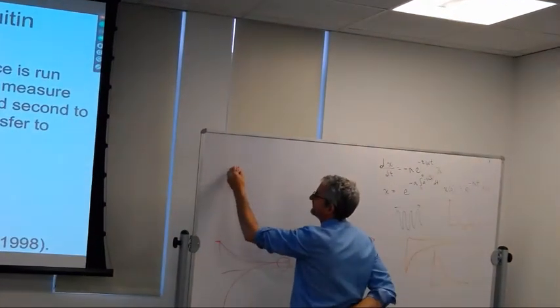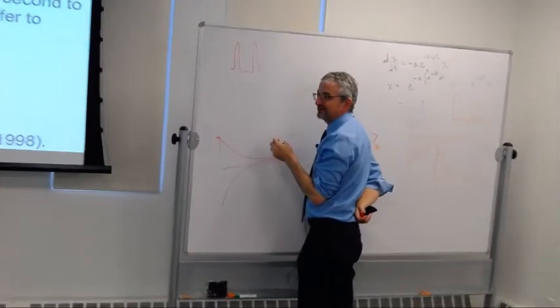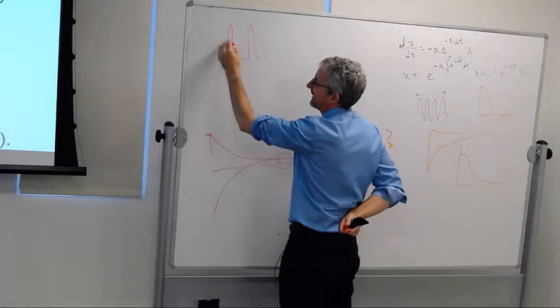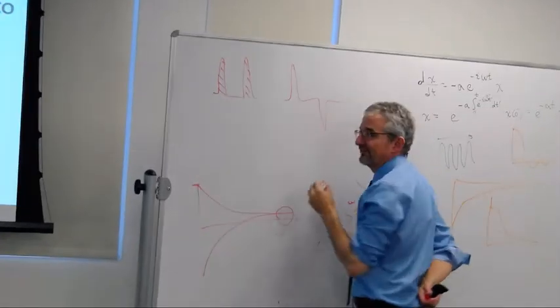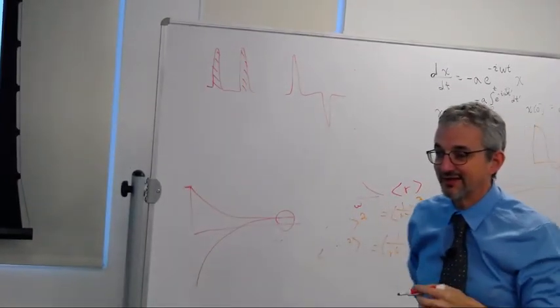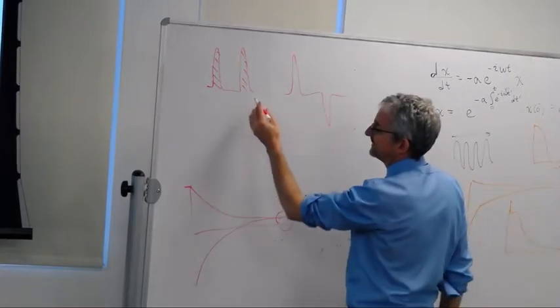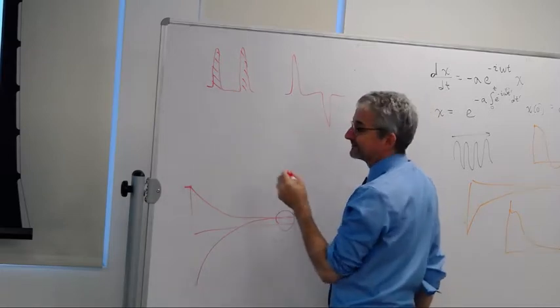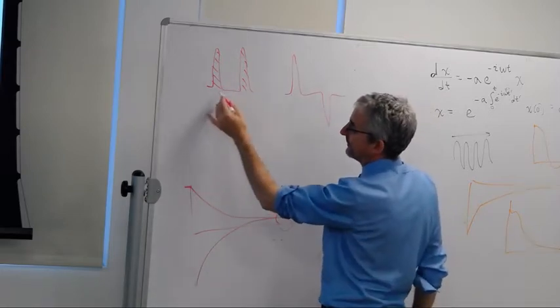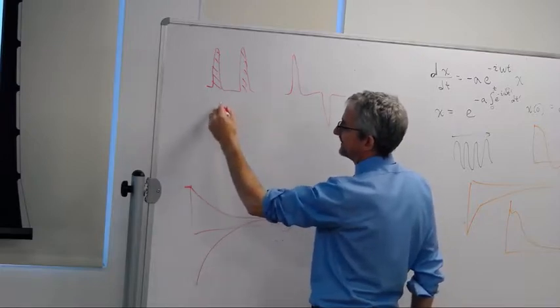And if we have in-phase magnetization, the two doublet components have the same integrated intensity. They may not be the same height because they'll have different line widths, but they have the same integrated intensity. And antiphase magnetization looks like that. So the amount of antiphase magnetization is the difference between the two doublet components. So if we started, for example, with in-phase magnetization, the amount of antiphase magnetization is 0.